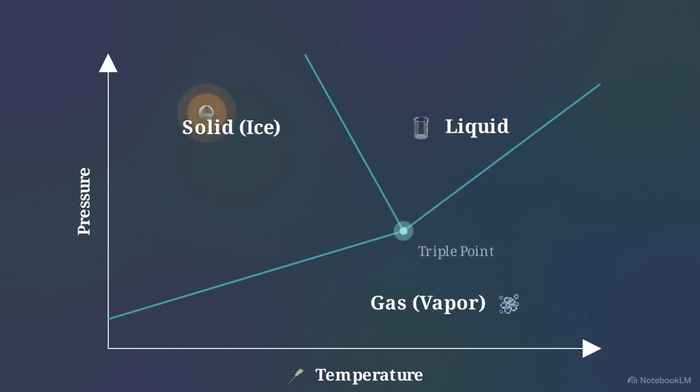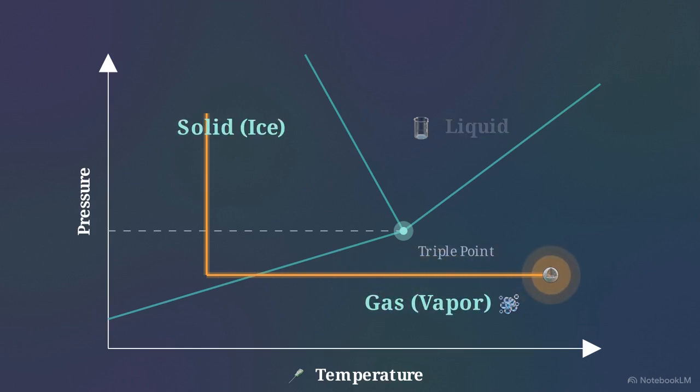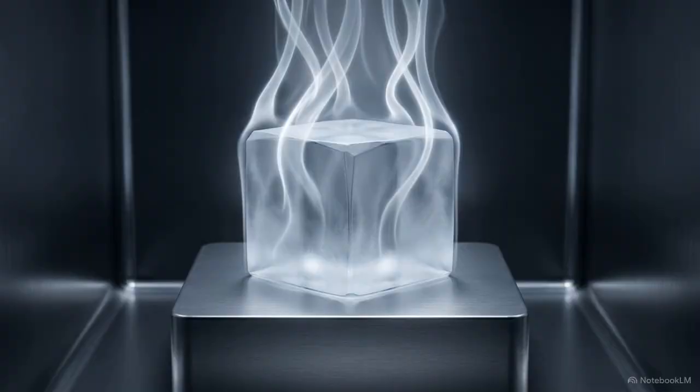The material is frozen solid, and the chamber pressure is dropped strictly below the thermodynamic triple point. The material then moves directly from the solid ice region into the gaseous vapor region, bypassing the liquid phase. This direct solid-to-vapor phase change is known as sublimation, and it is driven by maintaining a hard vacuum environment.